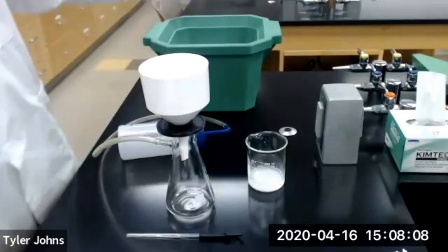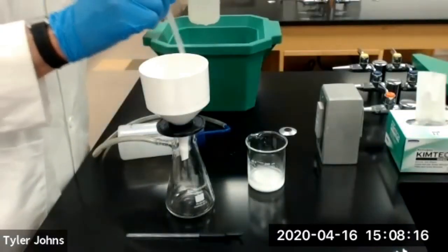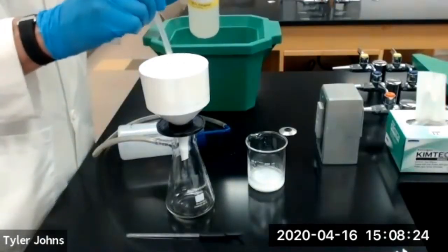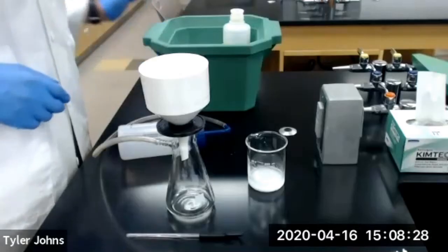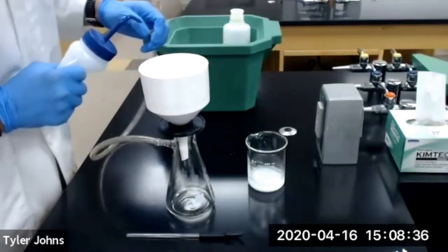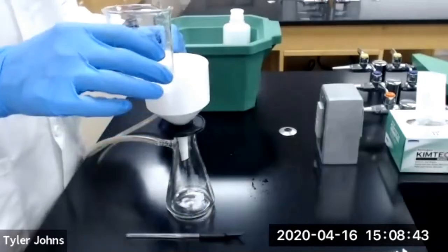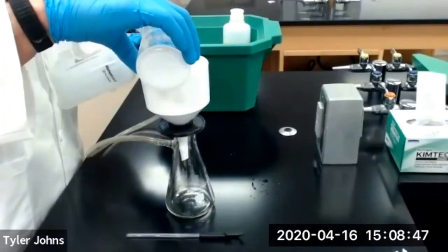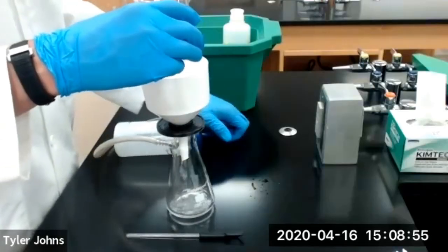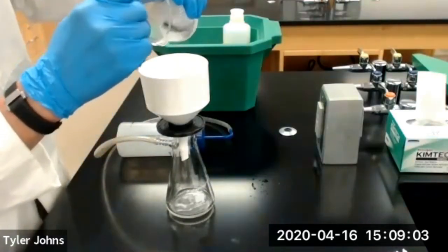So I'm going to dampen the filter paper with a little bit of 95% ethanol. I'm using 95% ethanol because the alum is not very soluble in the ethanol. Okay. So we'll start our vacuum, and we'll add our alum. I'm going to use a glass stir rod with a rubber policeman to help get the alum into the Buchner funnel.